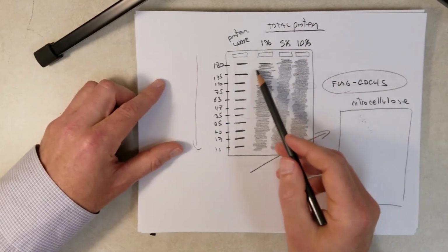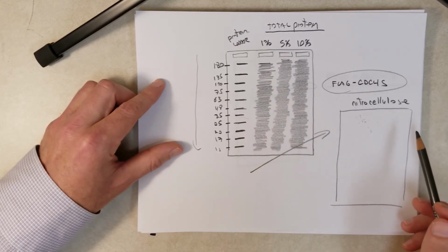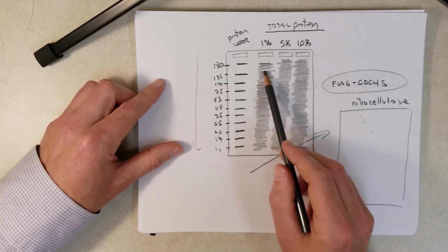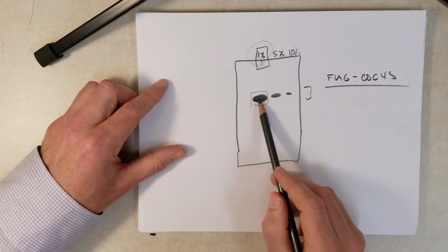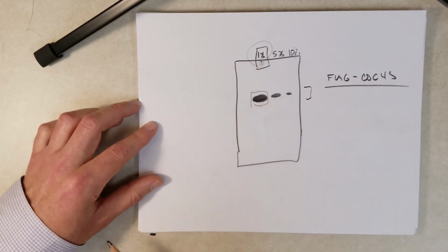And hopefully now you can see why Western blotting is useful, because if you're just using a stain that can stain all the proteins, you can't really see. You don't really know how much flag CDC45 is present in one condition relative to the other. But with Western blotting, you can clearly see that, oh, okay, there's more of the flag CDC45 in this condition relative to the other conditions.